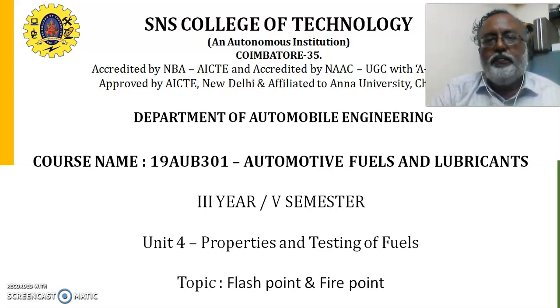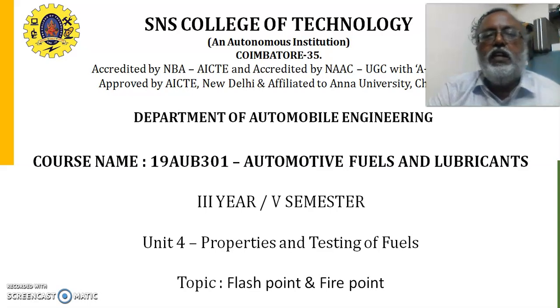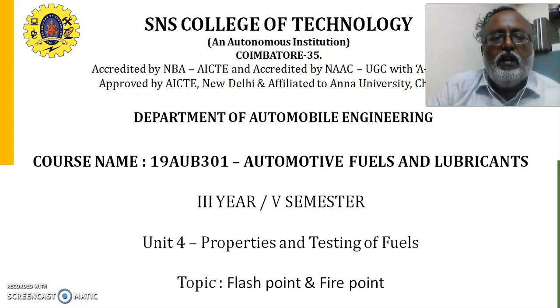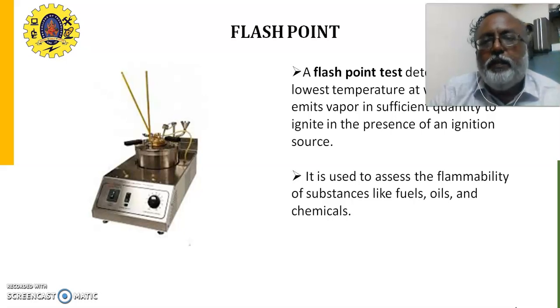Dear students, let us start the testing of fuels. There are a lot of tests for fuels, in which, in this video, let us discuss the flash point and fire point.